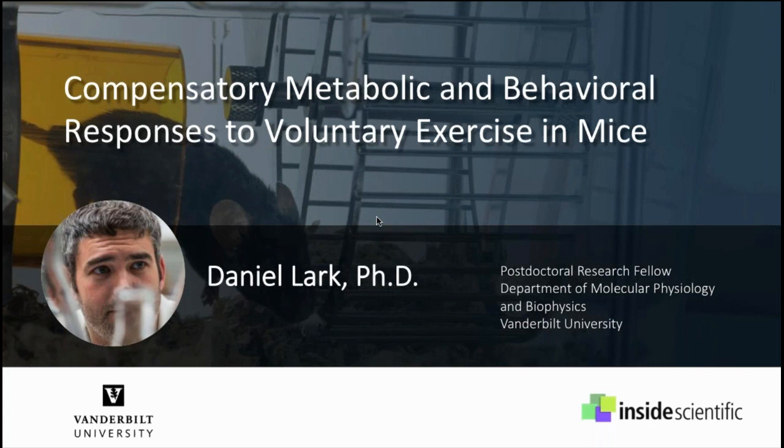So John finished his talk with an analogy of how you can take Sable Promethion data and go from a broad scope to a more refined scope, and that's what I'm going to show you in practice, how we've done this in the lab. I should note that my expertise is really mitochondrial function, and so we started off looking at some of this data through the lens of mitochondrial function, and we really didn't find anything of interest, so we were able to delve deeper into the information that we already had. Like John said, we took the data set that we had and really started peeling layers off of it, and that's how we came to the conclusions that I'm about to show you.